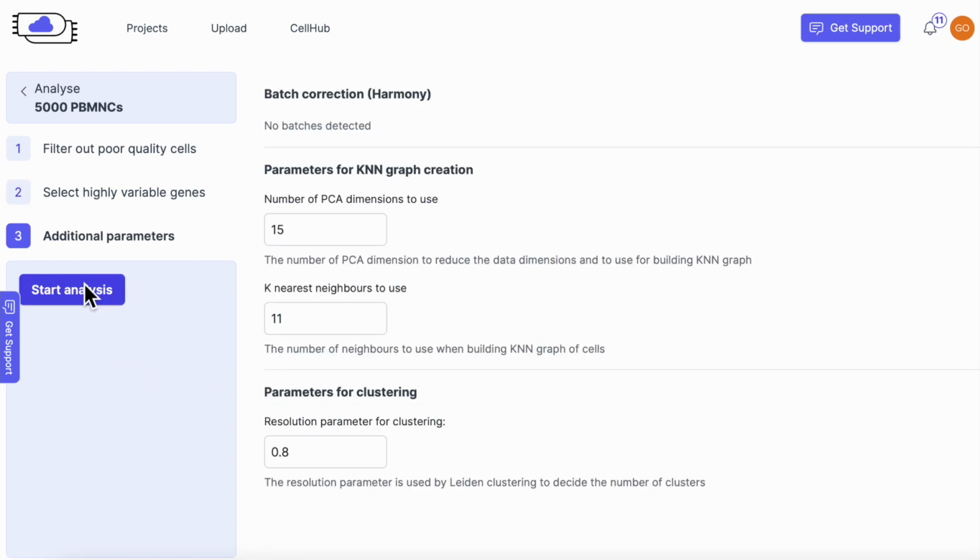The highly variable genes will be used to run PCA on your data, and we select now how many PCA dimensions we use. A high number here will create noise, and less is loss of heterogeneity. First, try the default setting of 15 and test by decreasing or increasing by 5. You look for a number where changing plus minus 5 doesn't make much difference to your results.